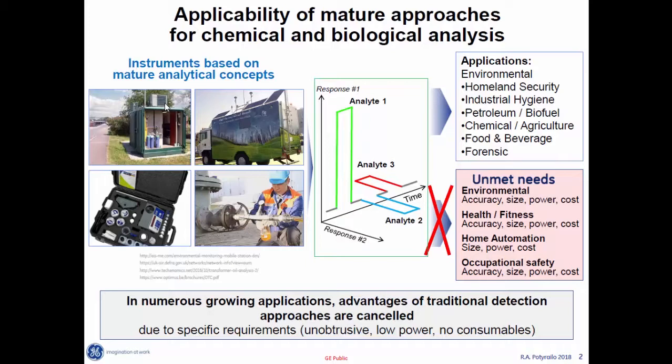Those things require periodic calibration, and guess what? These are the gas tanks to bring the gases. If the instruments need to be mobile, then you put them on a truck, okay? You are not discussing that because you would like to do the measurements in the right way. Those examples are when you take the sample in the field, for example, oil, you do those measurements maybe next to your asset and so on.